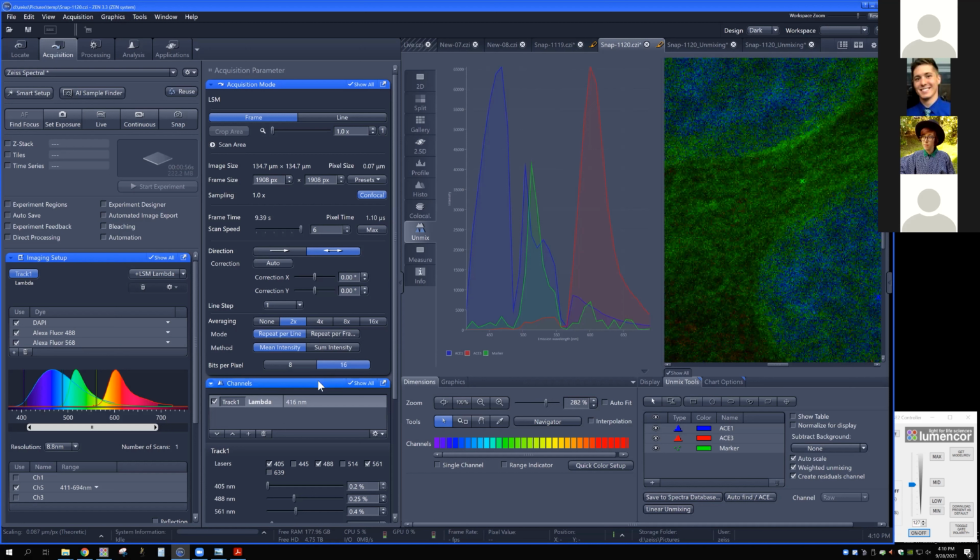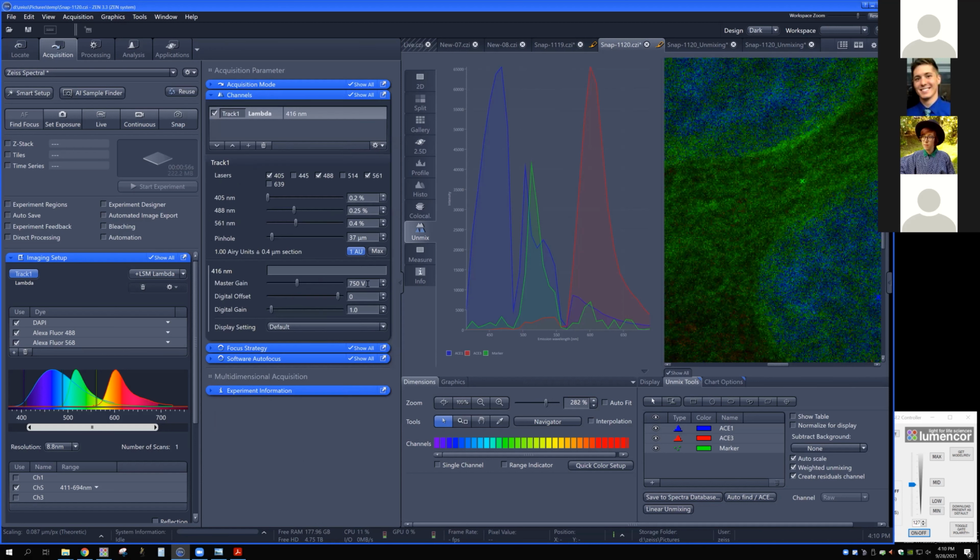And again, we're stuck with a single gain setting. So it's not like we can really adjust that to balance between the different fluorophores, but you can make some of your fluorophores off peak in terms of excitation, which is going to mean that those peaks in the fingerprints are going to be reduced or on a scale that's similar to the rest of these as well. And that way you can reserve the optimal spectral slots for your weaker signals or your less abundant signals to make sure that they have the best chance possible to shine in like a sea of other fluorophores, basically.